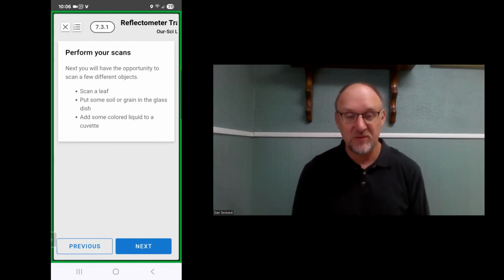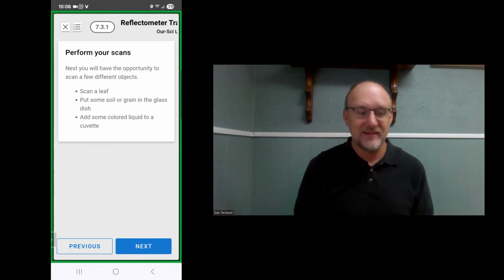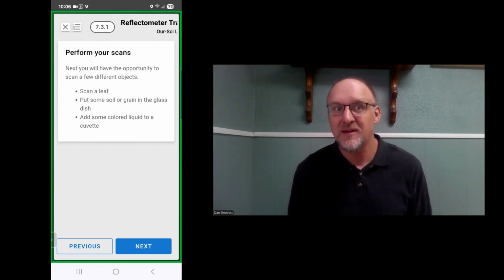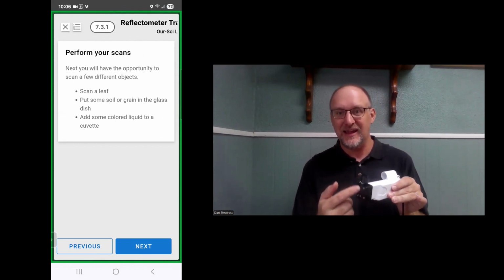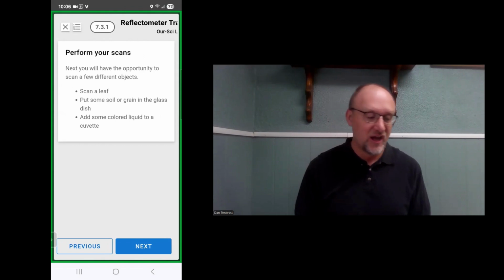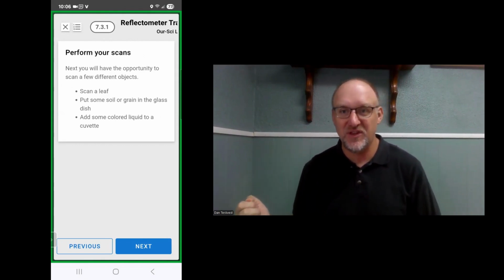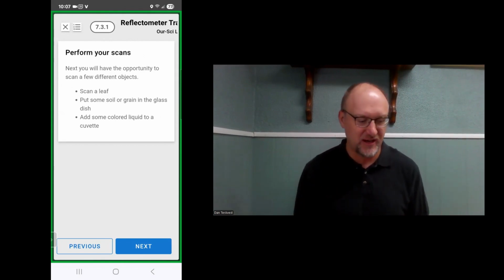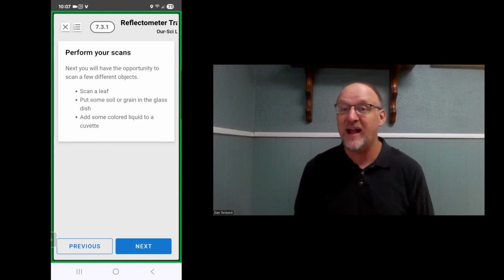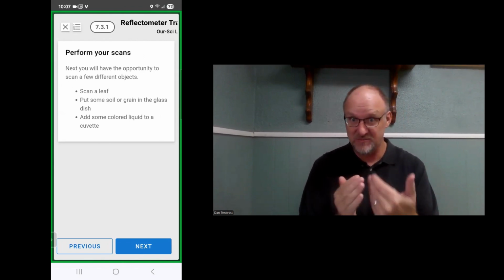When you do the closed calibration again, make sure that this is seated properly. And then when you do the QC, make sure that this cuvette is still in the cuvette holder and still flush. One of the most common errors is that people pull that calibration cuvette out and then they run the QC and get crazy numbers, because now they're measuring the back of the cuvette holder as opposed to the calibration stick, which is what is being compared.